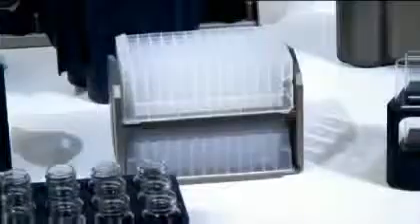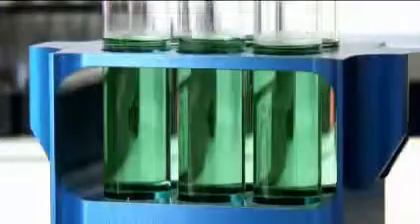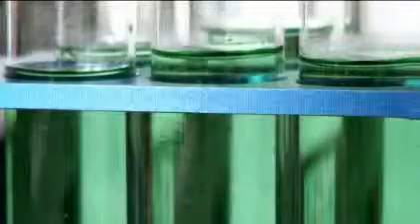If you need to concentrate rather than dry your samples, then the standard methods can be optimized by your local Genevac representative. In some cases, the addition of a solvent keep is necessary to ensure that the samples remain wet. The evaporation method is set to evaporate the more volatile solvent, leaving the keep solvent behind.